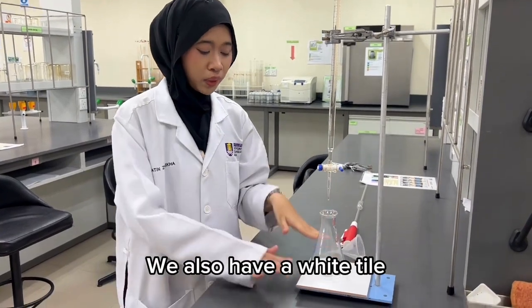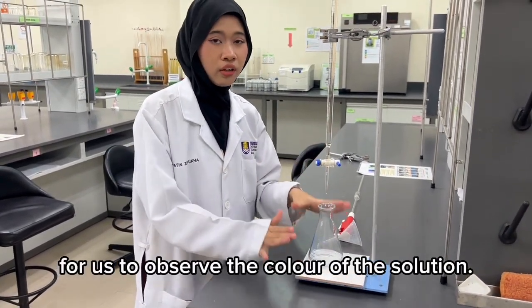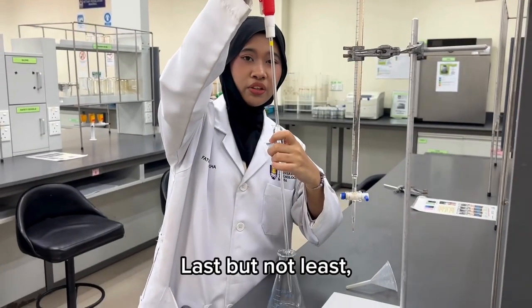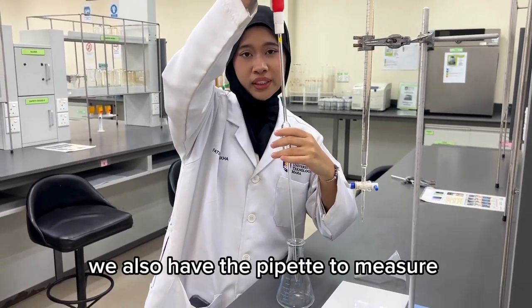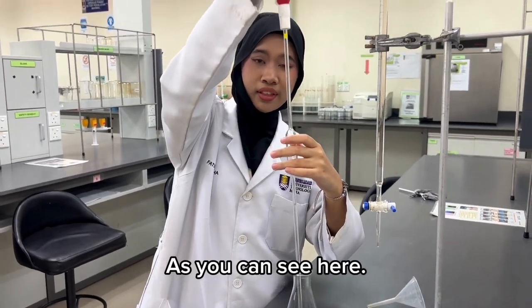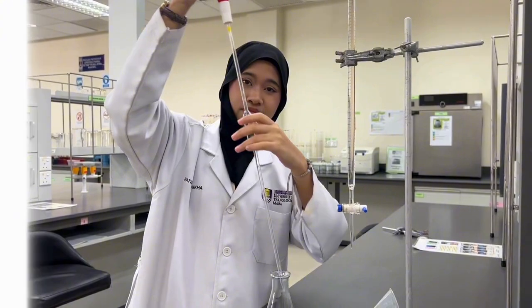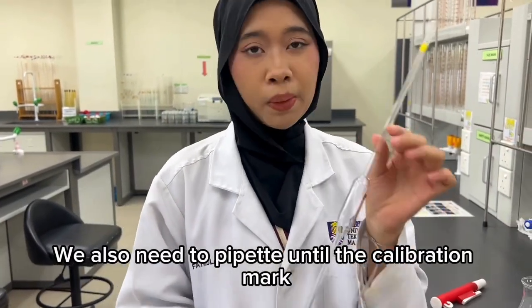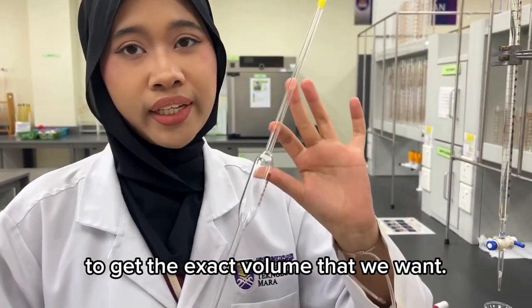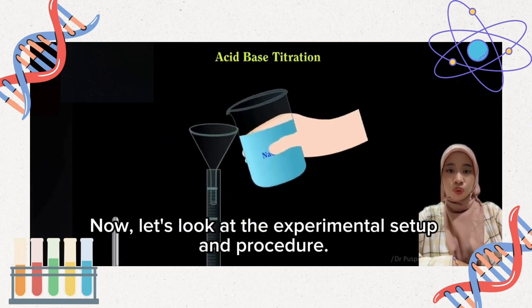We also have a white tile. The white tile helps us observe the color of the solution. As well as this, we also have a pipette to measure and transfer the exact amount of water sample into the conical flask, as you can see here. You have to take note, we need to pipette until the calibration mark to get the exact volume that we want. Now, let's look at the experimental setup and procedure.